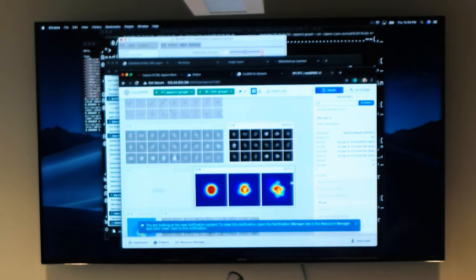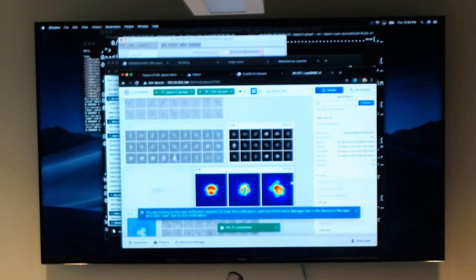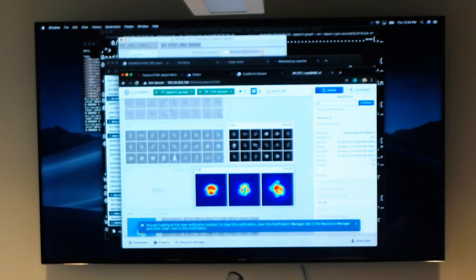However, the issue with fast subsets is, let's say it chooses a non-random subset, or statistically, unfortunately, it randomly chose things, but of the same view, then it will be misrepresented. Let's say you have all views, but for some odd reason, the first 100 particles end up being the same exact view. You may have an issue, unless, in this case, we have symmetry that we can overcome certain things. But that's unusual. I would buy a lottery ticket if that was the case, because you'd be in a very special regime.